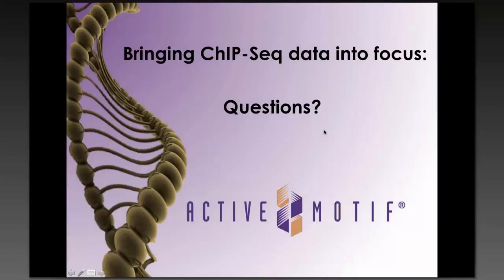Yeah. So I think that's possible, but very little DNA comes out of a ChIP reaction. So for most antibodies, you're in a range where you can't reliably quantitate the amount of DNA coming out. For K27, the antibody's really good and the mark is abundant, so you're actually pulling out levels where you can get some kind of quantitation, but it's still on the lower end. So I don't think it's completely reliable. But assuming those numbers are reliable, you could do that, but it's not going to apply to most ChIP reactions where you're using different antibodies.